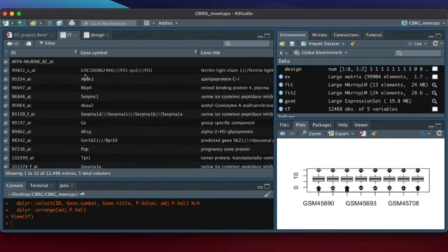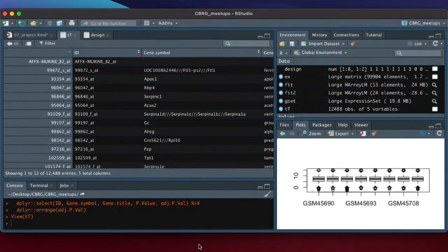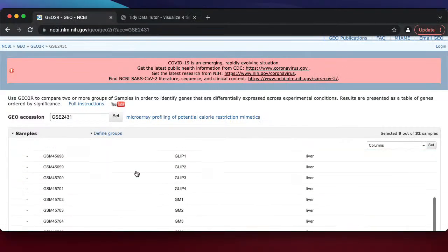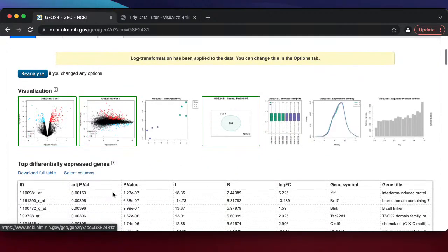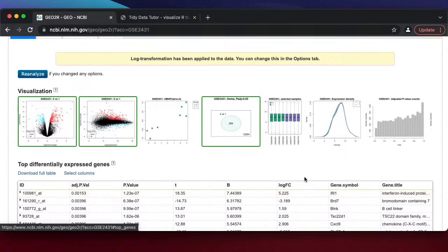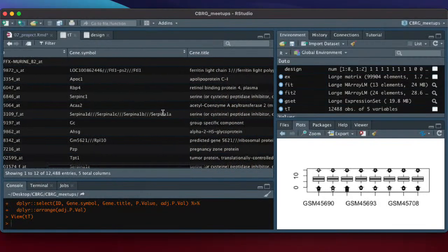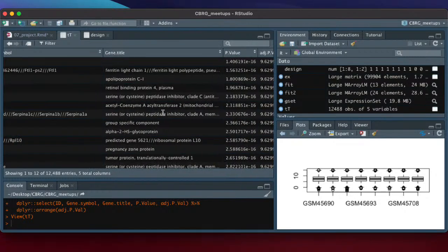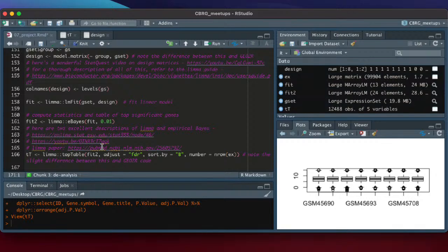this is the real test. So it's this one here. Ferritin. I mean, something might have gone wrong. I hope it's the same as the one we saw when we did this analysis here. No. I ran this previously and I got exactly the same output, so I'm a little concerned that I'm not seeing the same thing. I wonder why that is. Anyway, I'll work that out and try to see why this is.